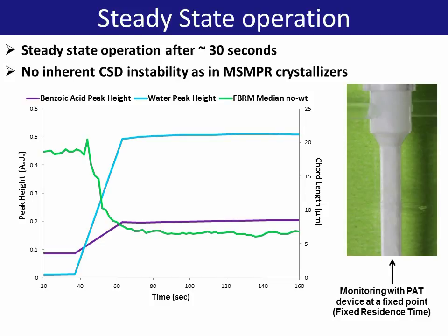The rapid progression to steady state, combined with the small volume of the system, means that although the plug flow may be sufficiently productive for industrial scale pharma applications, the amount of material required for characterization will be similar to that for current batch process development. Therefore, it may be possible to avoid scaling up altogether and possibly introduce numbering up of units if additional capacity is required.